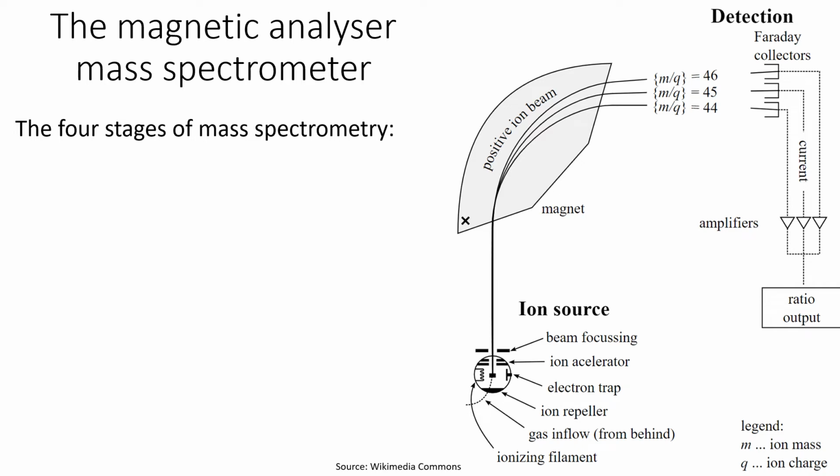Welcome to this seventh and final session on atomic structure. We're going to be looking at some extension material here about the mass spectrometer, and we can use this to detect the masses of atoms as well as molecules.